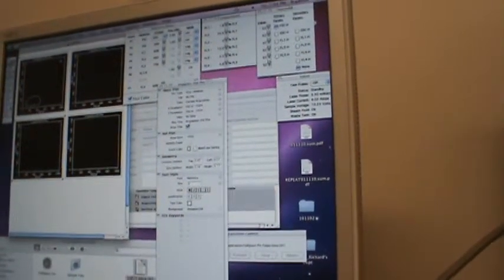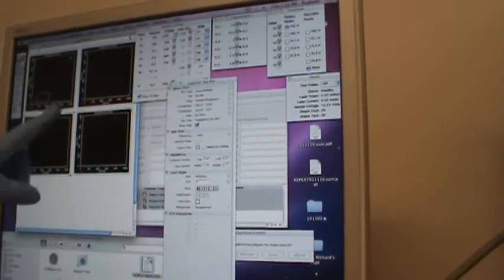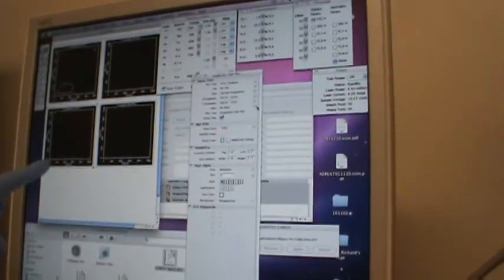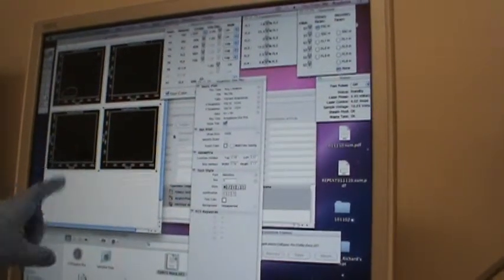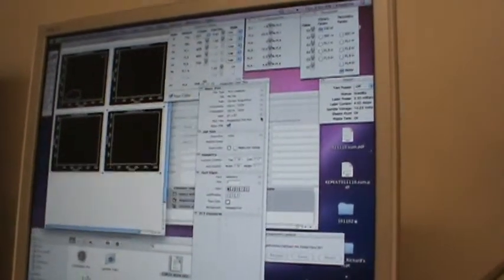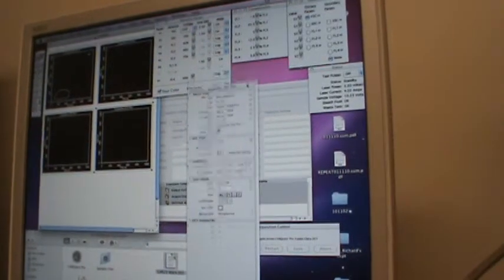So for this plot, I would like to say this, and for this one, I would like to say the same, because I don't want all the junk. I'll show you once I put the cells here. I will go back and remove the gate and show you what happens if I say no gate. You will see all the junk which has come out of that.